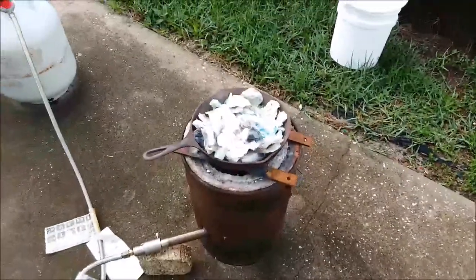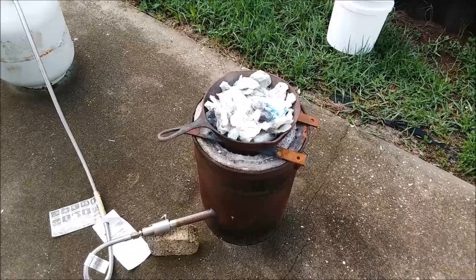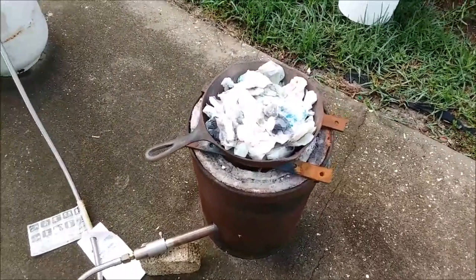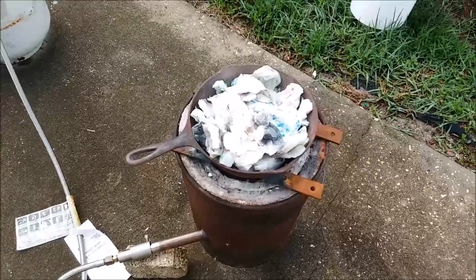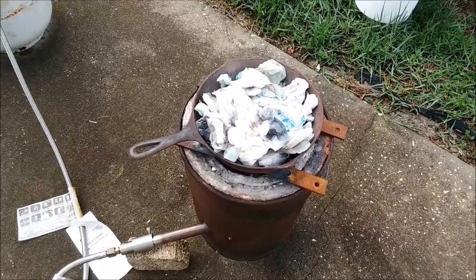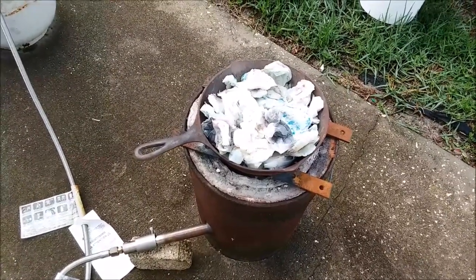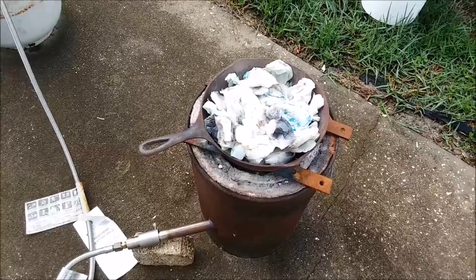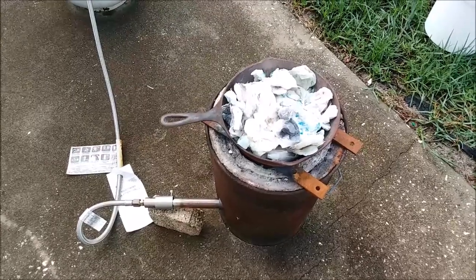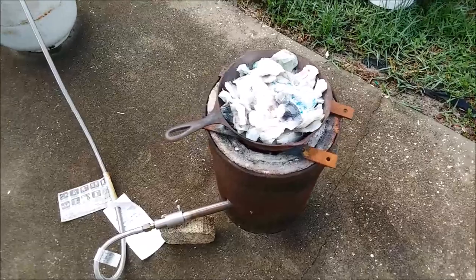Good morning, YouTubers. Today I'm going to process all of my used filters. This is all my filters from gold production, and anything else that might have gold on it — any paper towels I've used to wipe up spills, anything that might possibly have gold on it. I have three mason jars full of this stuff, and they're just stuffed as full as they can be. So it's time to process it.